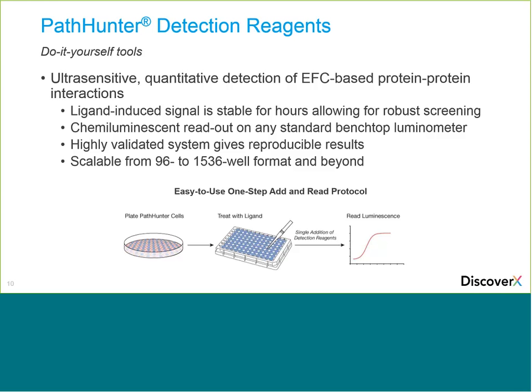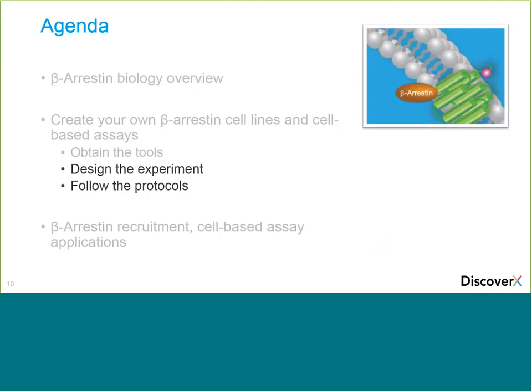All right, next you may want to analyze mutations. Mutations sometimes block protein-protein interactions or prevent ligand-induced protein activation, ultimately causing diseases or disorders, such as hyperthyroidism, fertility disorders, different cancers. So you may want to look at differences between the wild-type receptor compared to your mutants, looking at SNPs. Maybe study rare diseases that, due to inherited genetic mutations, identifying ligands that functionally rescue mutant receptors. And that's the one I thought I would use as example today.